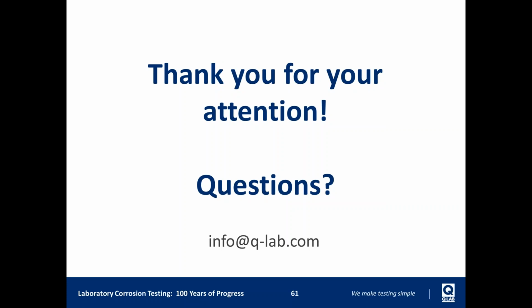Now, with other manufacturers, you might get a change in uniformity of the salt spray by adjusting the on-off time or adjusting the pump rate that they're using. So I can't speak to that. But for our testers, you would use the on-off time.